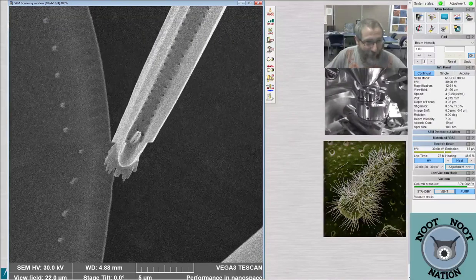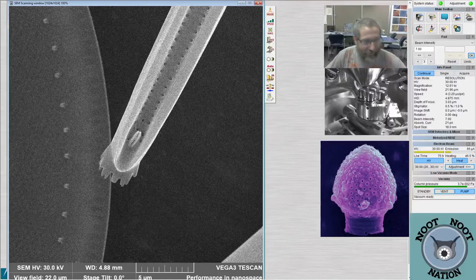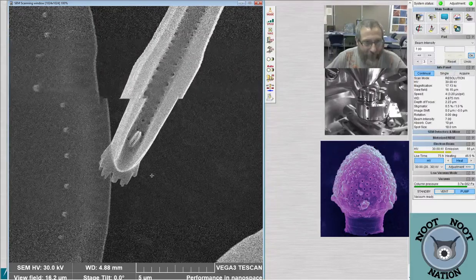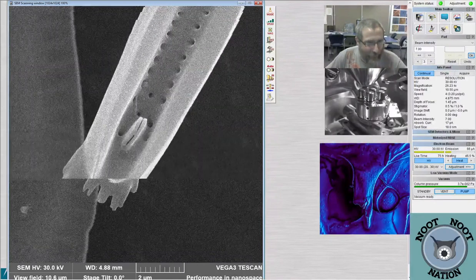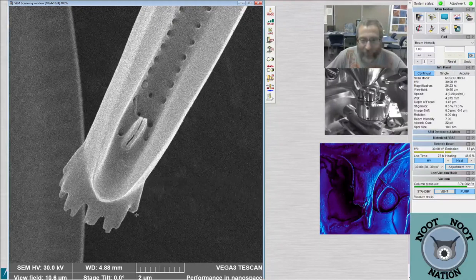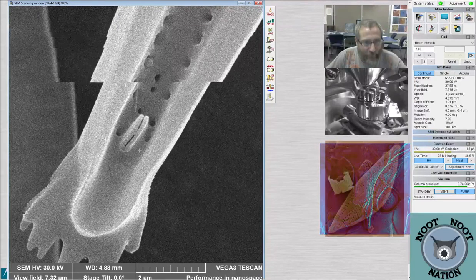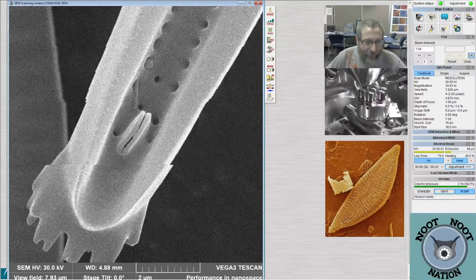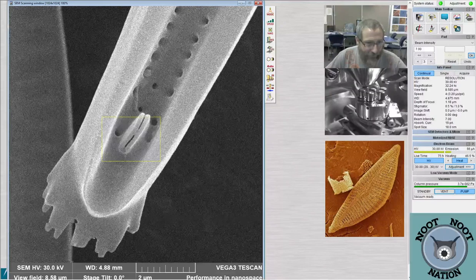That is a Rimoportula right there. And these spines are somehow associated, pointing off the end of the diatom. So there's some cool stuff going on. It seems pretty simple when we were looking at the middle part, but then it's got this flangey spine structure out here. And that's a Rimoportula, so it belongs with the Fragilarias. It does. It has to.